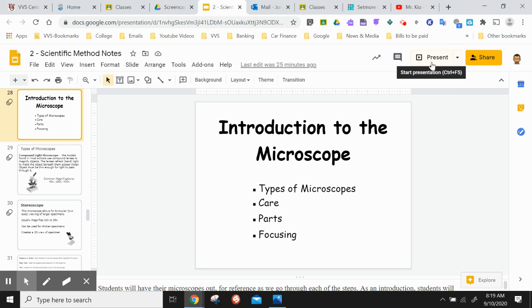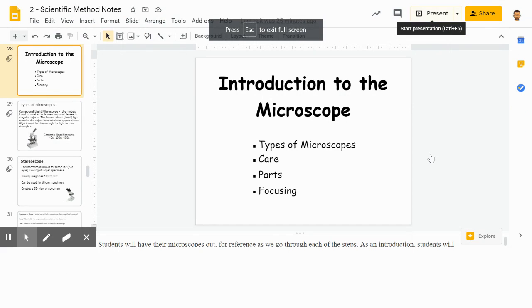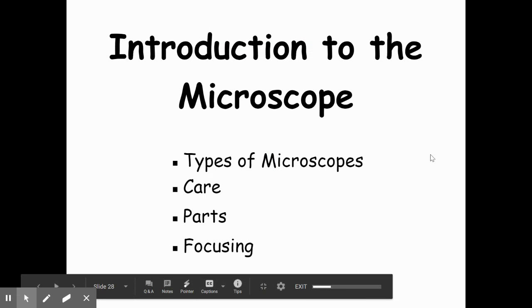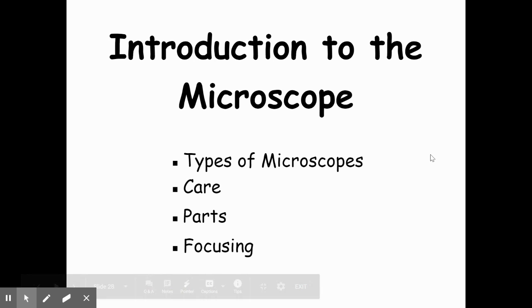All right, we're going to do a quick little video on just an introduction to the microscope. Talk a little bit about a couple different types of microscopes, care, parts of the microscope, how to focus it, that sort of thing.